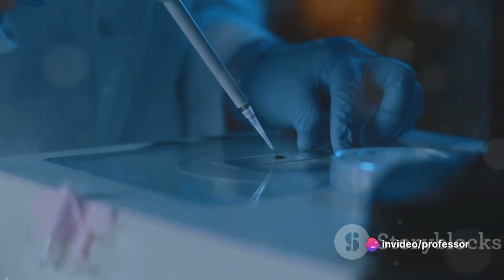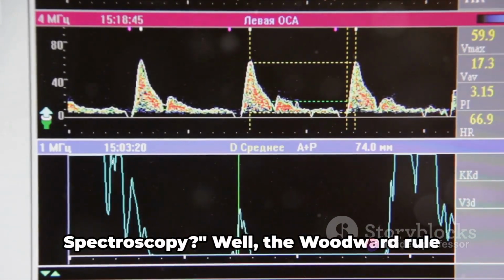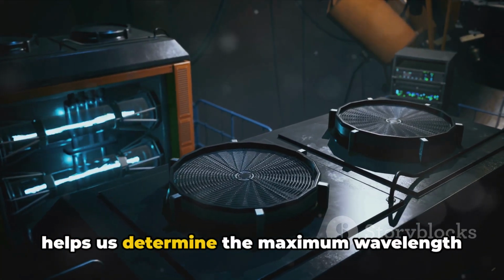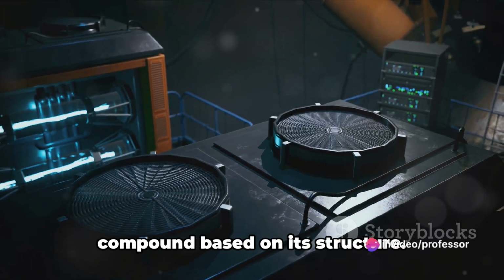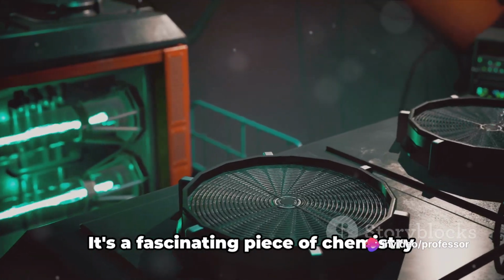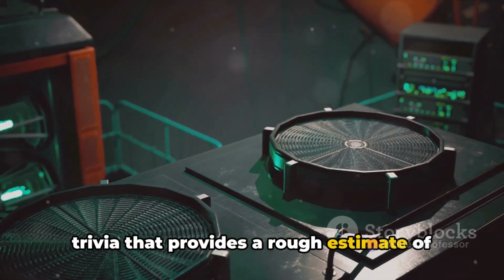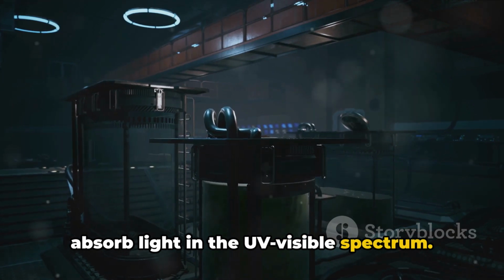Let's explore more. Ever heard of the Woodward rule and photometry in the context of UV visible spectroscopy? Well, the Woodward rule helps us determine the maximum wavelength of absorption, or lambda max, of a compound based on its structure. It's a fascinating piece of chemistry trivia that provides a rough estimate of where certain functional groups will absorb light in the UV visible spectrum.